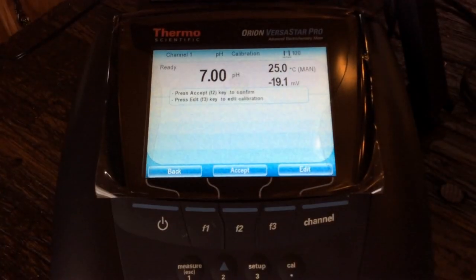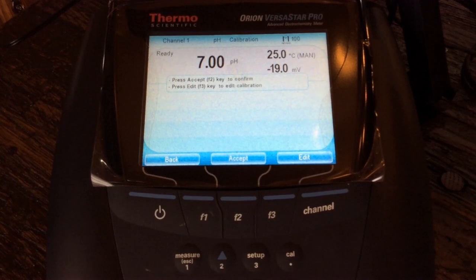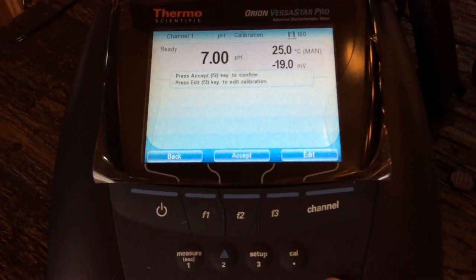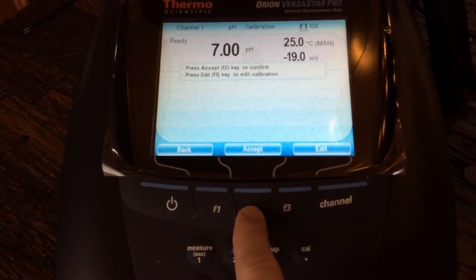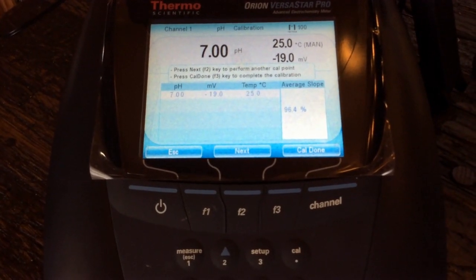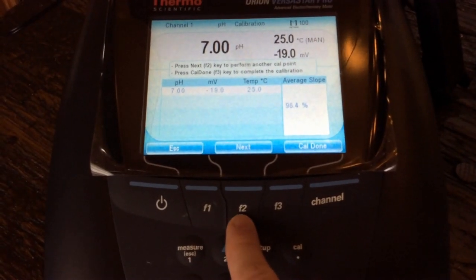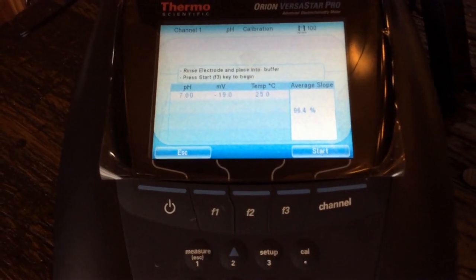We've calibrated to the 7. It asks you to accept — F2 to confirm — or press edit to edit the calibration. We want to accept that, so we hit F2 to confirm. Now it's saying press next to perform another cal point or cal done. If you just want to do a single calibration, you hit F3. But we want to go ahead and do a two-point calibration here, so we're going to hit F2 to go to next.